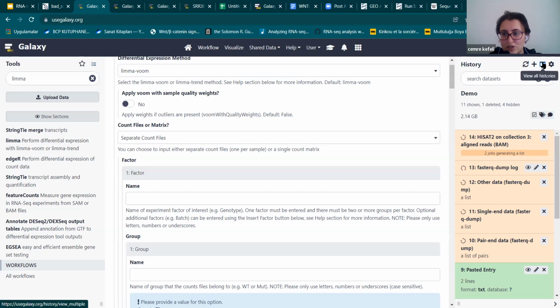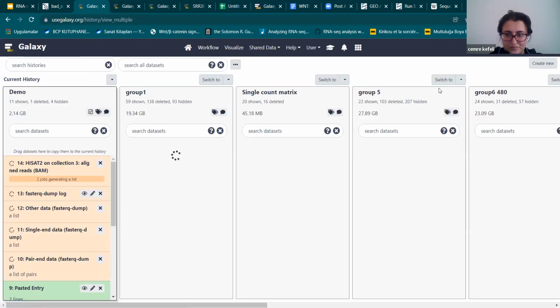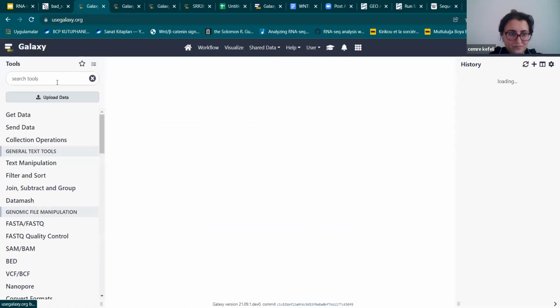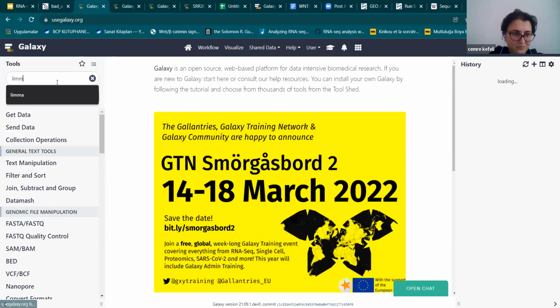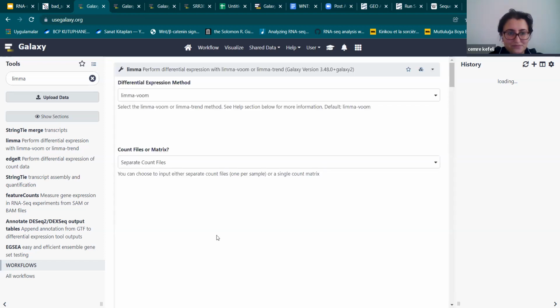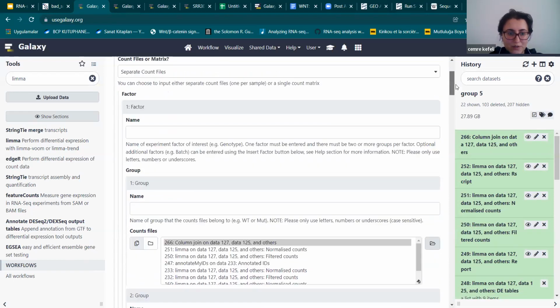Let me change my history. Yeah, we will provide several count files.